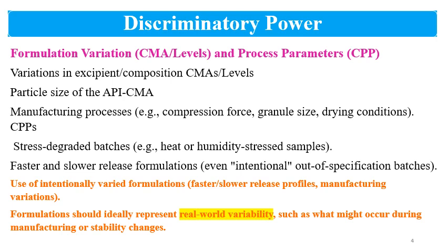So finalize your process, finalize the parameters, and then make meaningful changes to the composition and the process parameters. Meaningful variations are 10 to 20% variation to the finalized parameter, whether it is the concentration level of excipient or the critical process parameter range. You can play with the hardness in case of tablet.